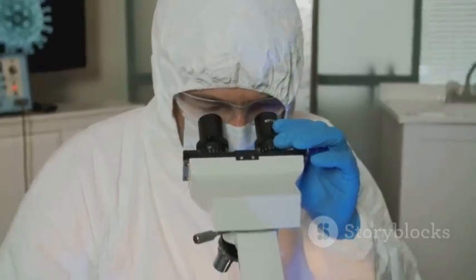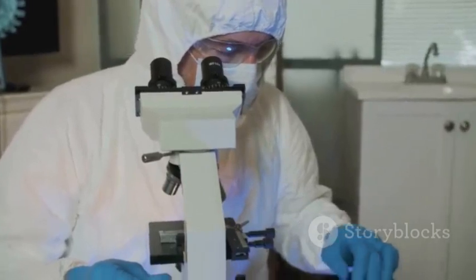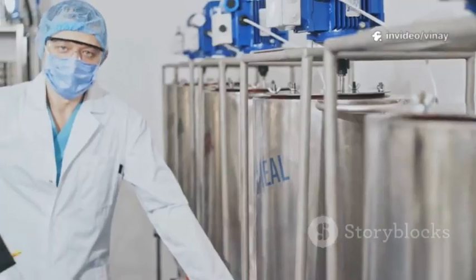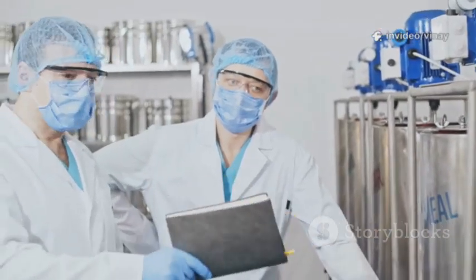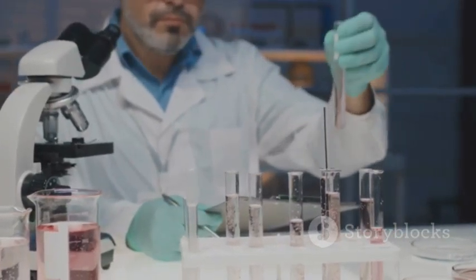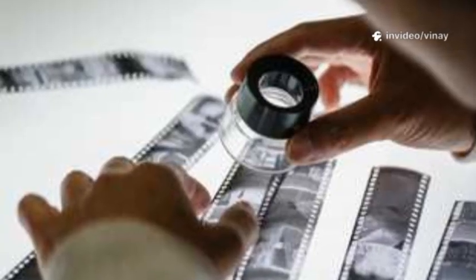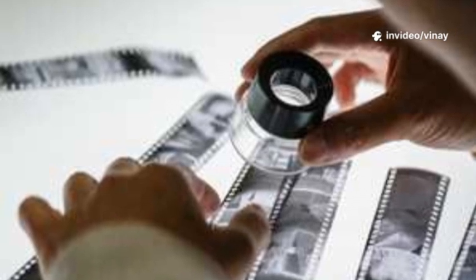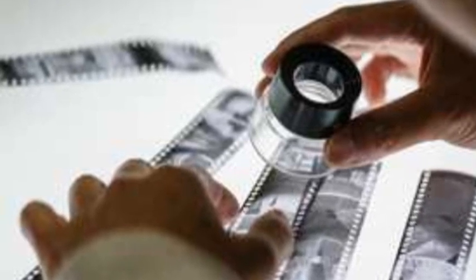Now, why do we need to test them? Because these filters are delicate structures. They can be damaged in many ways. Maybe the filter was dropped during shipping, or maybe it was installed incorrectly into the filtration system. Sometimes, a very high pressure or a very hot cleaning process can create a tiny weakness or a tear in the filter material. Even a flaw that is too small for the human eye to see can be a huge problem. A microscopic tear could create a pathway that is bigger than 0.22 micrometers, allowing bacteria to sneak through into the final product.